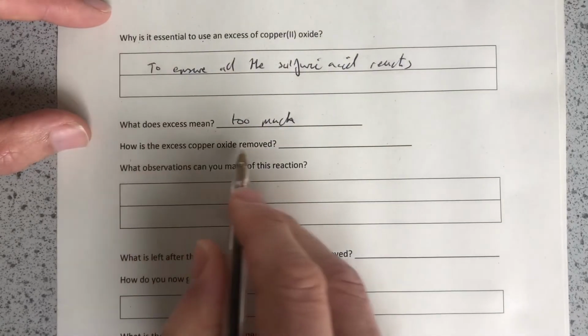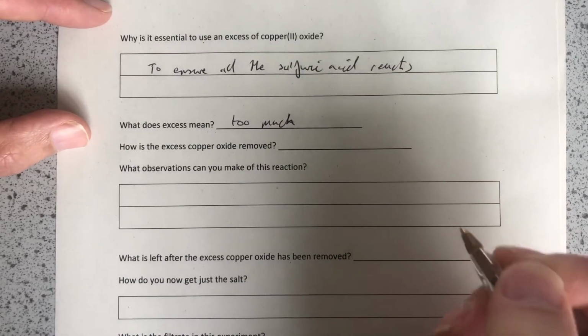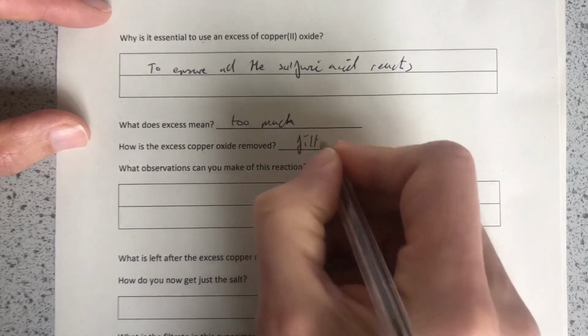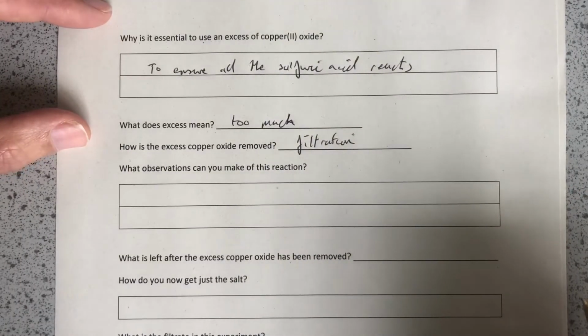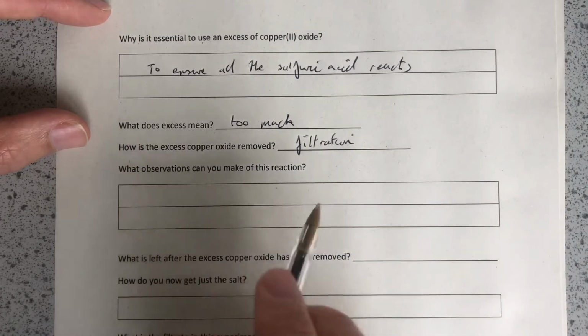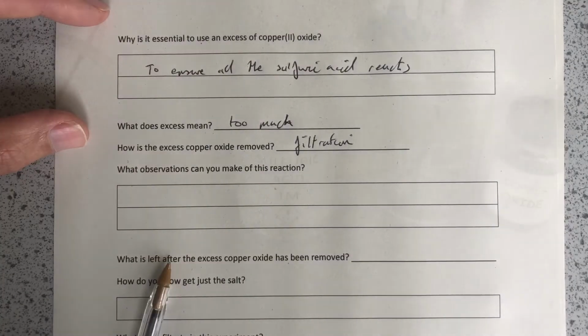So how is the excess copper oxide removed? We need a separating technique to remove an insoluble solid from a liquid, and that separating technique is filtration. So we filter out the excess reactant. What observations can you make during this reaction? Well, let's have a look as we start it off.